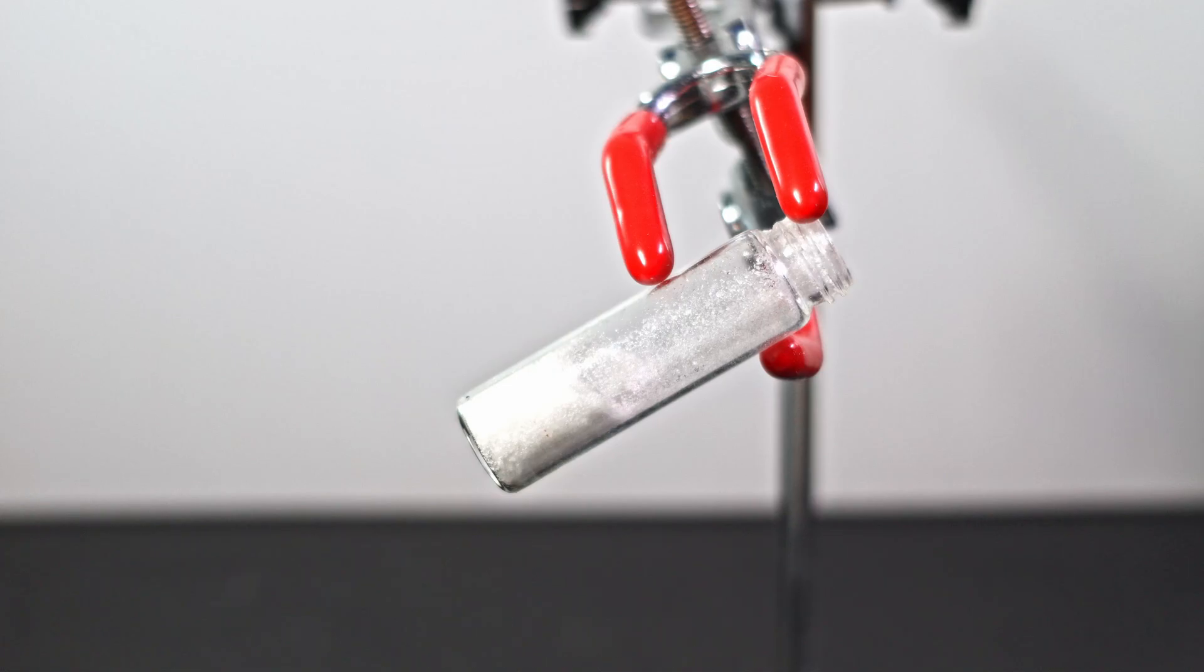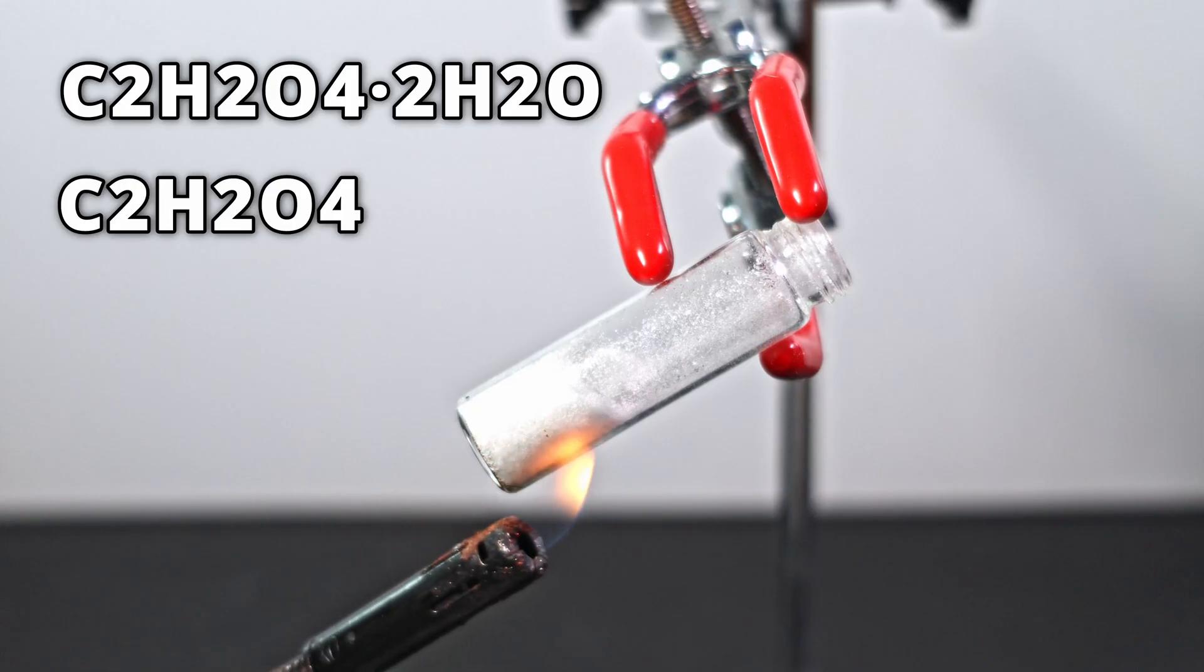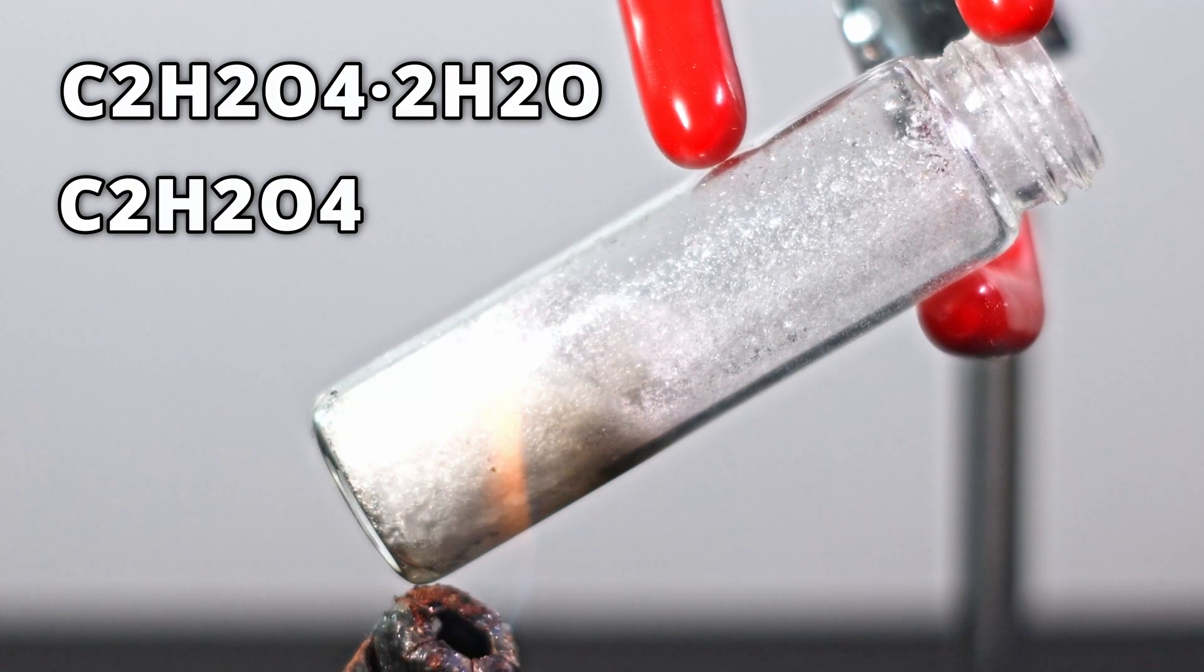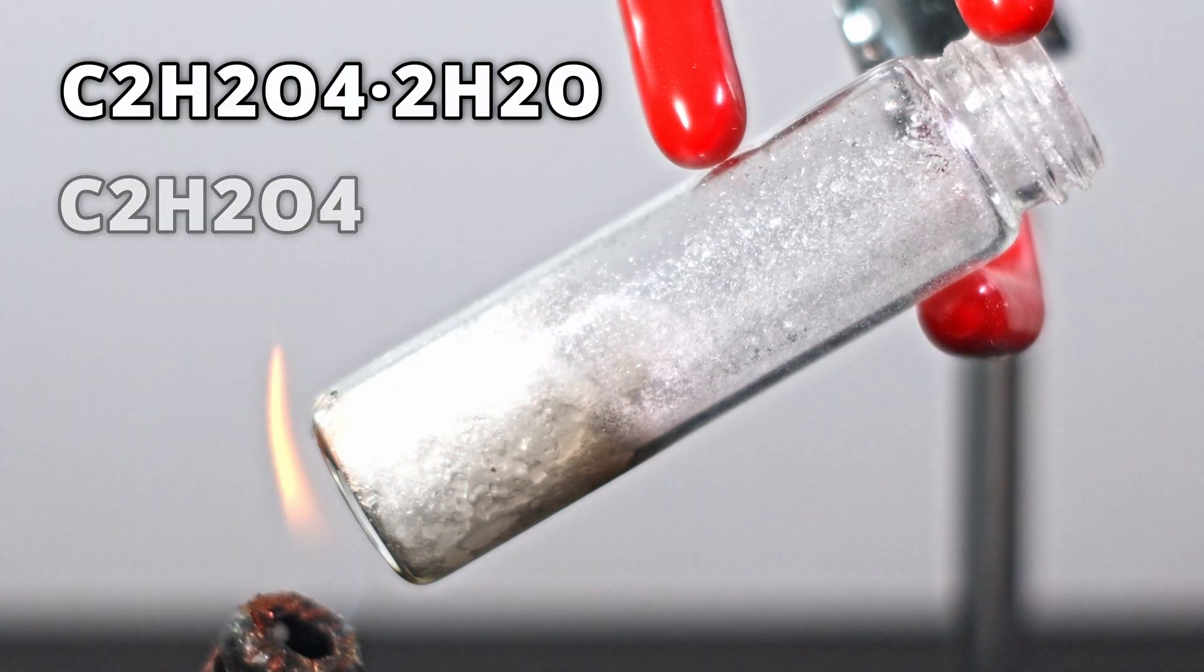The first thing we need to do is determine whether we have the dihydrate or anhydrous form. A simple way to test is to apply strong heating. The oxalic acid soon begins to melt and exude water, crystal clear evidence that we have the dihydrate.